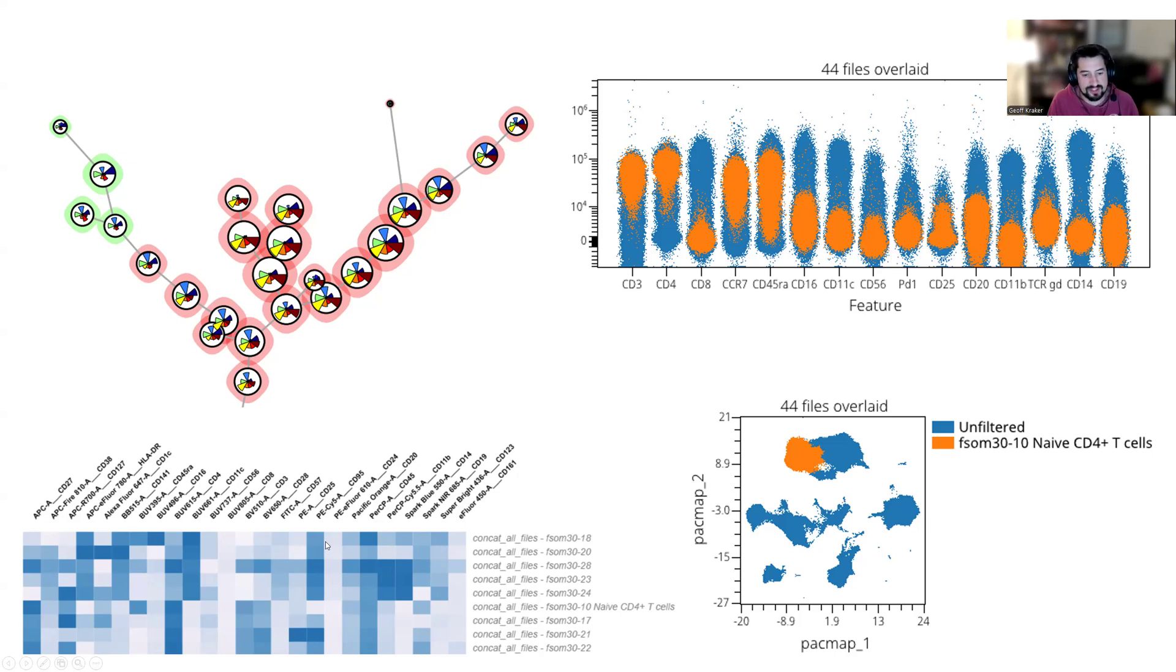Other people will visualize them by plotting every cluster versus every channel that they use to generate those clusters to pull out a phenotype in a heat map. This is a very efficient way to display the phenotypes, but has a handful of drawbacks. So instead, I personally like to use this special x-axis type plot where we're overlaying a single cluster on top of total events in all of the relevant particular channels that we would have used for clustering. And in this case, you can see that this cluster of interest is CD3 positive, 4 positive, 8 negative, CCR7 positive, 45RA mostly positive. But it can be beneficial because here you can see there's a bit of heterogeneity present. And also, you get an idea about the abundance of this particular cluster compared to the total events.